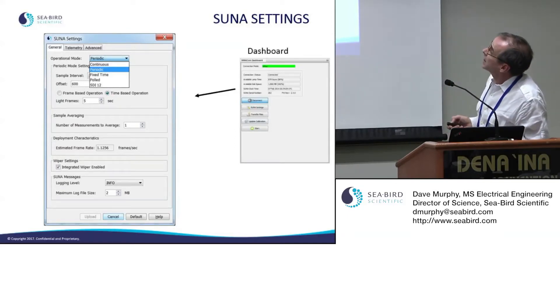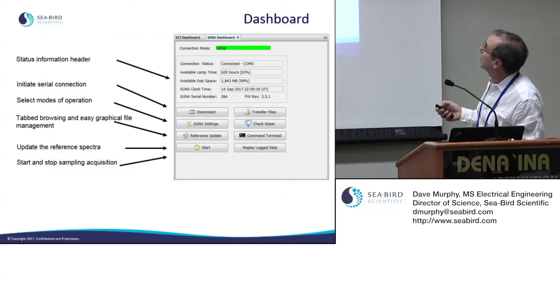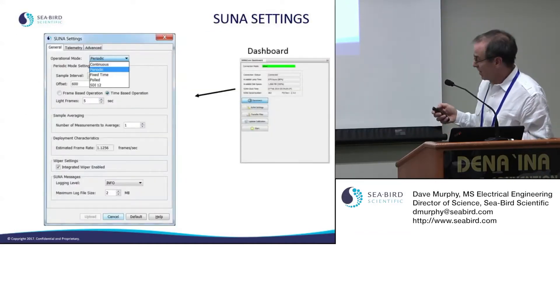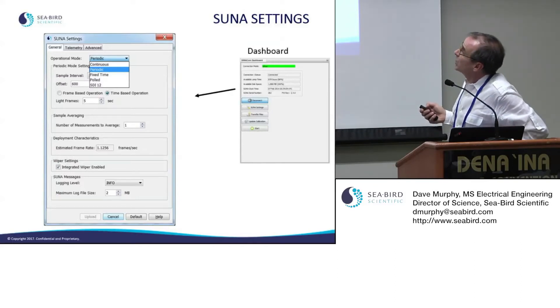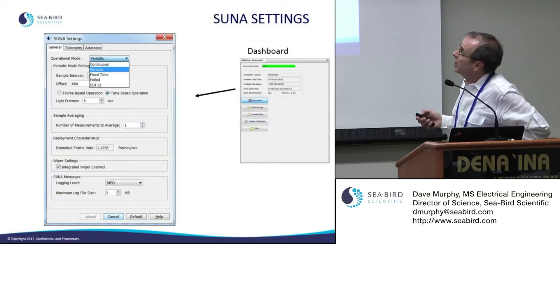On the SUNA dashboard, if you click on SUNA settings you get the SUNA settings dashboard. You pick the mode of sampling: continuous, periodic, fixed-time, polled, or SDI-12. You also set the sample interval and offset.